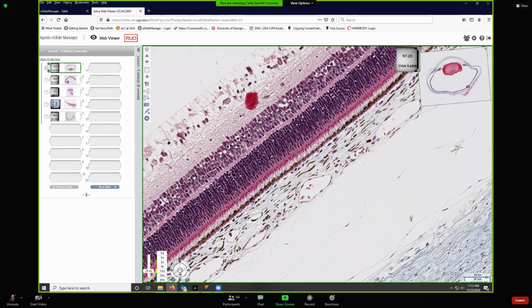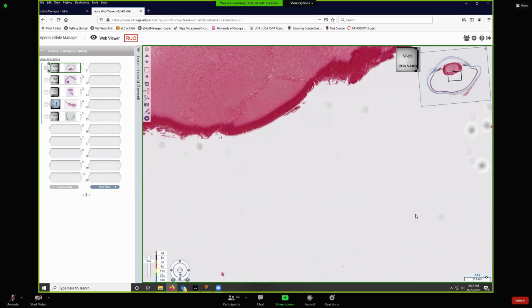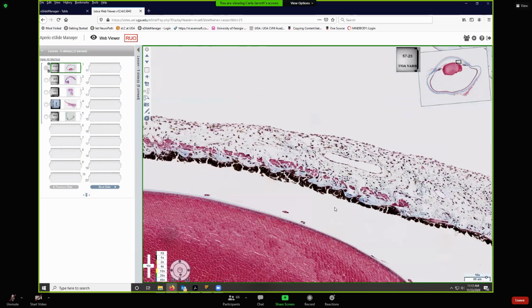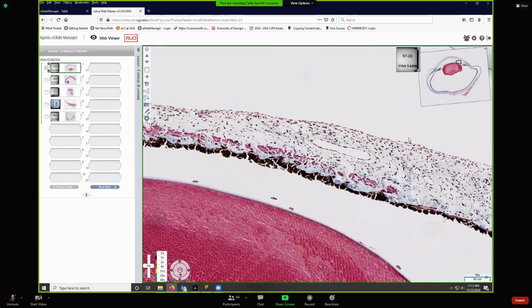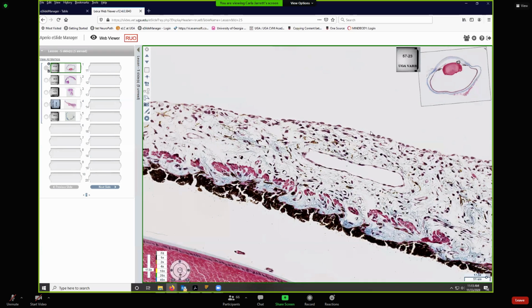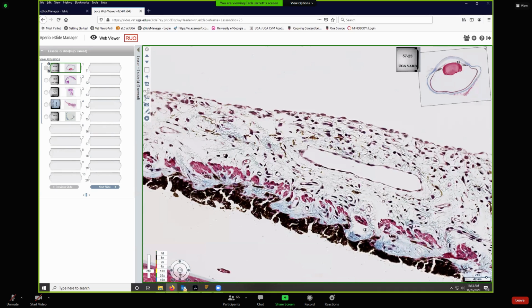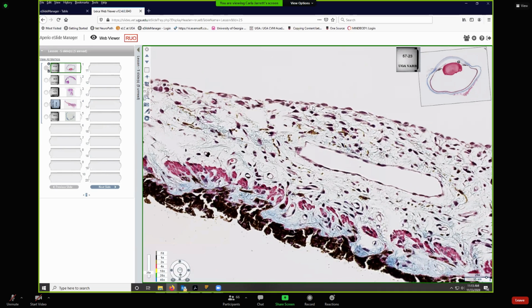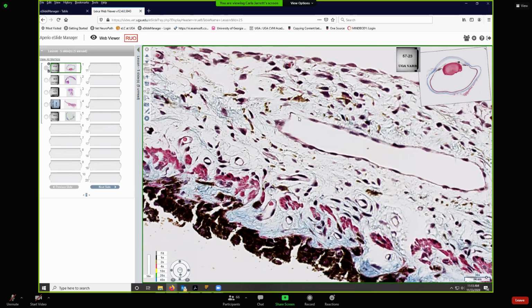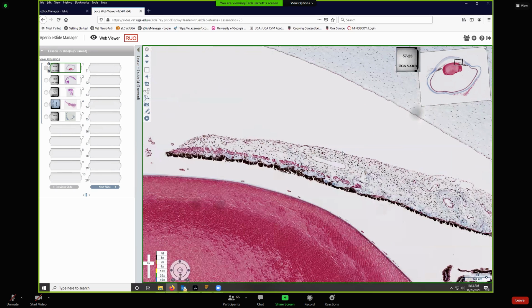Okay. And so the one thing that was listed that is not a basement membrane, and this was to see if you understand the layers of the iris, is this: the anterior limiting layer of the iris. It is not a basement membrane. It's just a weird layer made up of these specialized stromal cells, these fibroblast cells. It's just called an anterior limiting layer, but it's not called the anterior basal complex or basement membrane or anything like that. So that was the one thing that is not a basement membrane.